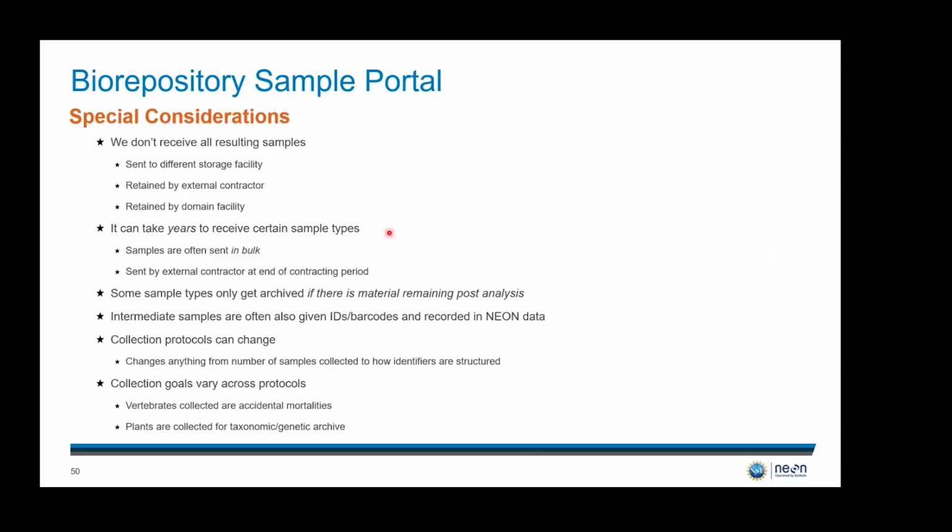So first, we've already talked about this, but we don't receive all resulting samples from a protocol, right? Of course, some are sent to a different storage facility, some are retained by the external contractor, and some are retained by the domain facility. So it's just a good thing to know that we don't necessarily always have them. Someone else might have them.